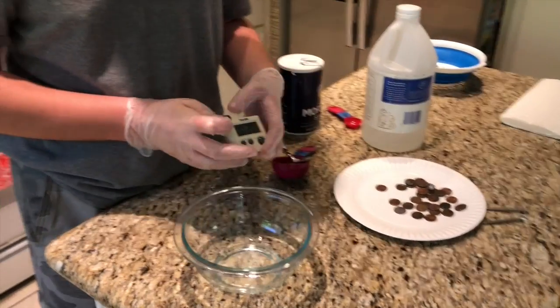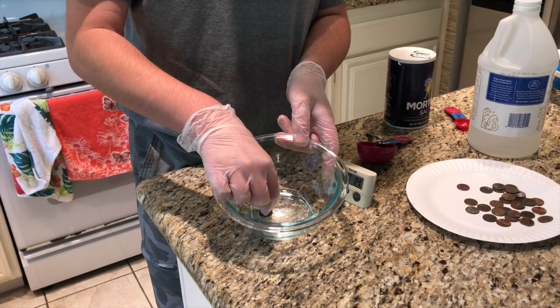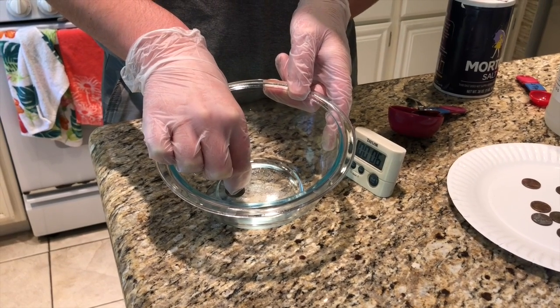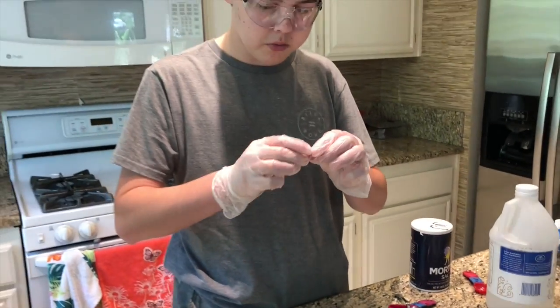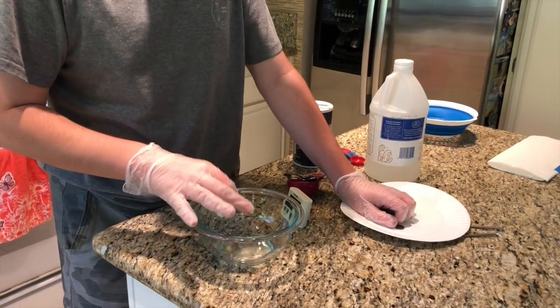And what should happen here is the copper oxide on the outside of this penny should dissociate back into the ions copper and oxide. So I'm going to set the timer, and I'm going to stick it in. So as you can hopefully see now, half of this penny has become a lot more shiny and clear, and the other half is still a bit dull. Well, let's see what happens when we put the rest of the pennies in for 5 minutes.